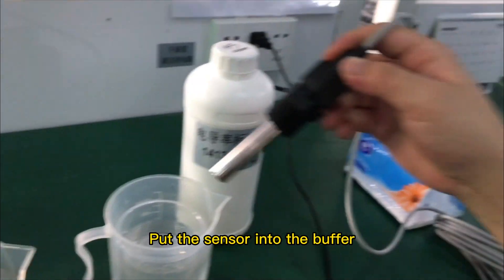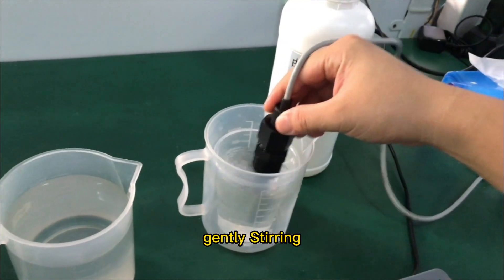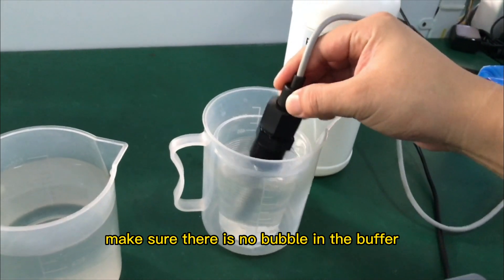Prepare a standard buffer. Put the sensor into the buffer and gently stir. Make sure there are no bubbles in the buffer.